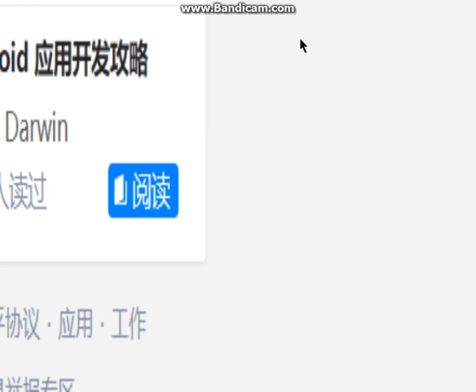This is an animation that shows the electrospray process. The analytes are the coloured squares and circles, and the charges can be seen on the droplet as it evaporates. Nitrogen gas is shown flowing in the opposite direction — this counter-flow of gas helps the evaporation process, though evaporation would occur naturally anyway.